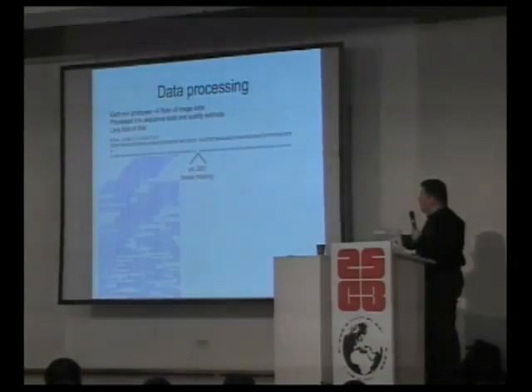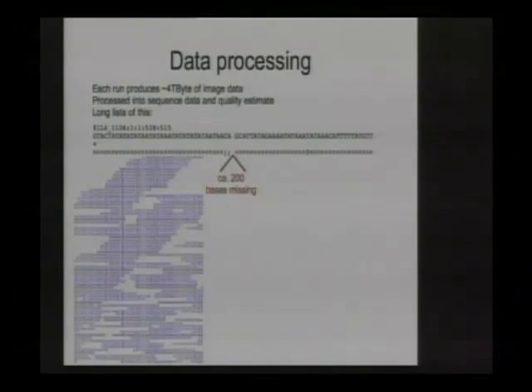So you get lots and lots of lines of this. Each flow cell has 8 lanes, which run in parallel and can carry different samples to be sequenced. And at the moment, I get about 9 million of these per lane. So it's quite a bag of reads.